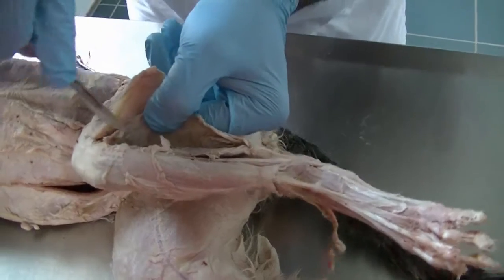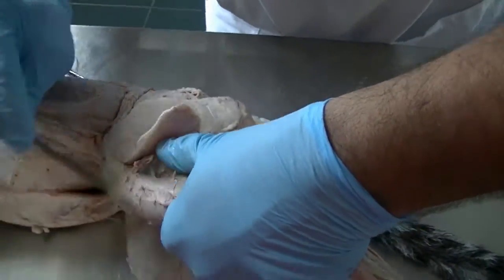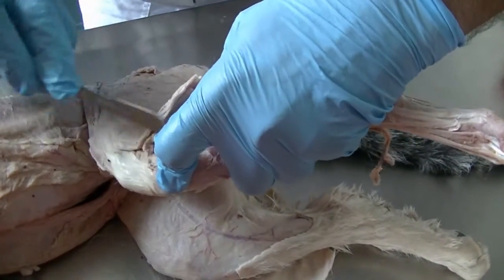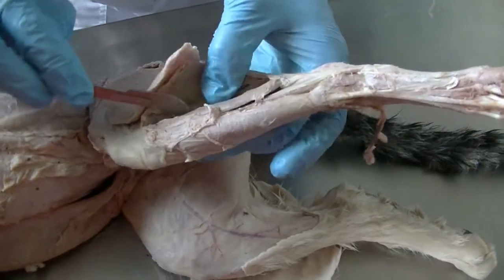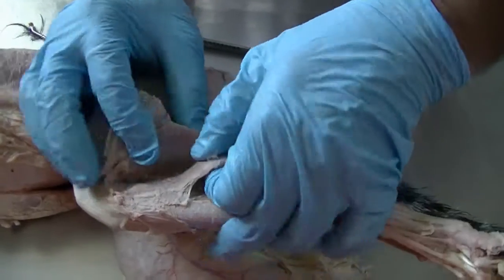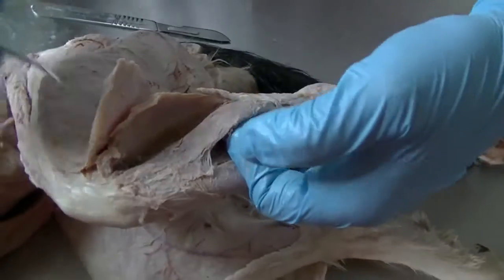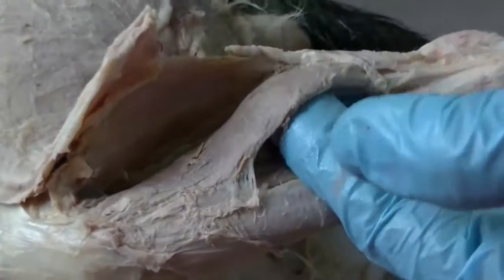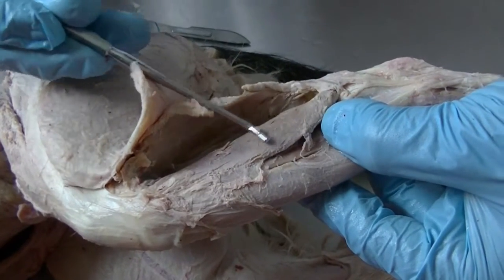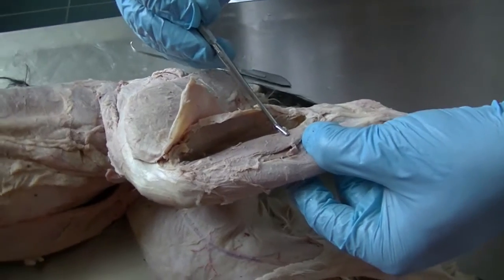So let's transect the gastrocnemius a little bit more and look at that muscle as we can trace it from the tibia, making sure that it is not coming off the femur. The superficial digital flexor originates on the femur, while your soleus originates on the tibia. So we can see it originating from the tibia, descending further down and becoming part of the common calcaneal tendon, that is your soleus muscle. This muscle is absent in the dog, and is very well formed and well developed in the cat.